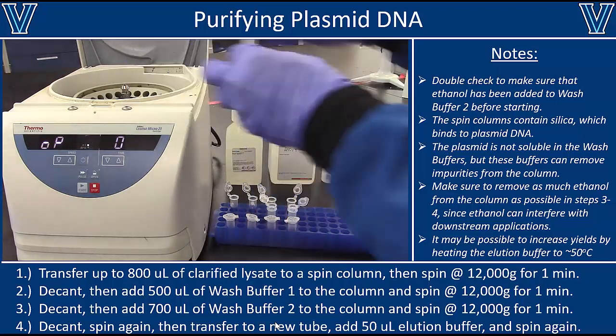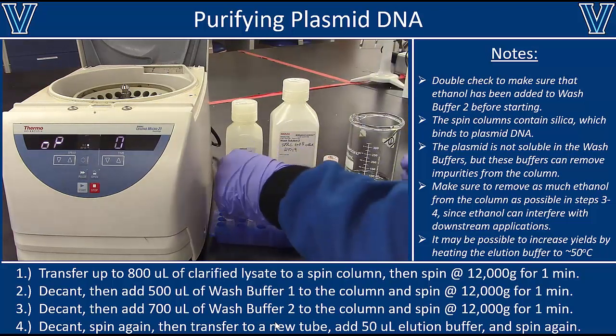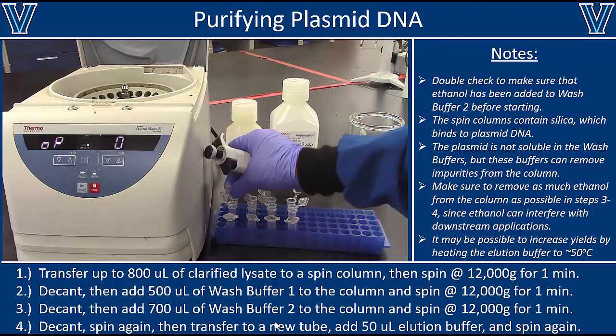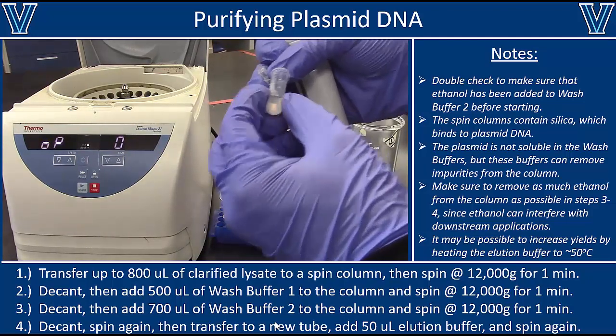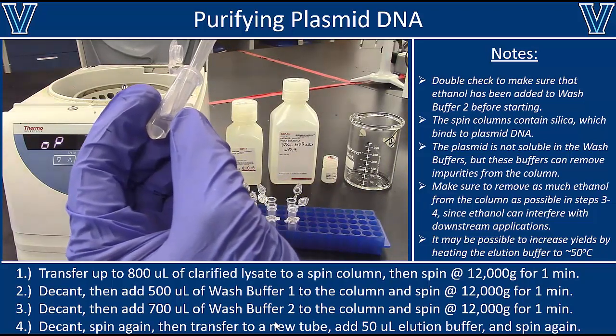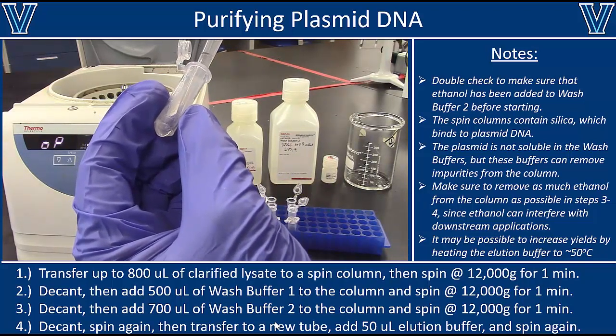Now, you may very well have more than 800 microliters in your sample. If that is the case, then just load the rest of your sample onto the spin columns and repeat this spin. You can do that as many times as you want. If you've got a larger sample, you can do multiple spins to load all of that on there.